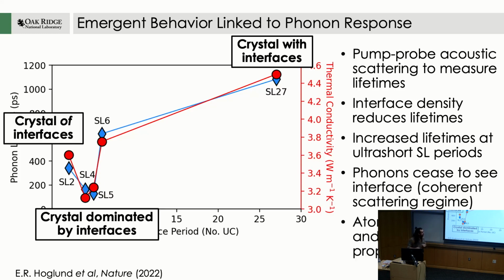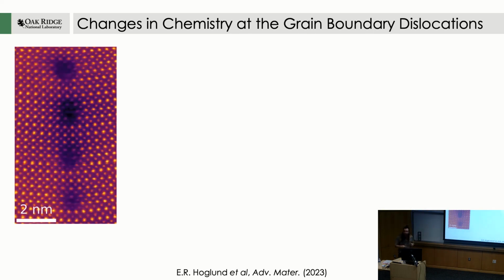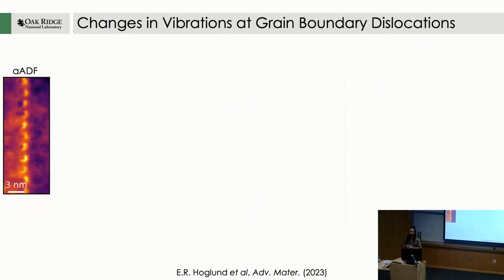I'm going to quickly just go through the grain boundary results because I think these are really nice. You can do compositional EELS the same way we talked about at the start of this talk, and you can map the oxygen, you can map the strontium, and you can map the titanium. So you can understand the chemistry present in these materials. We see that we're pretty much consistent in terms of our oxygen content, but we're strontium poor at the grain boundary dislocations and titanium rich. So we know at these dislocation cores, we fundamentally change the chemistry of the material.